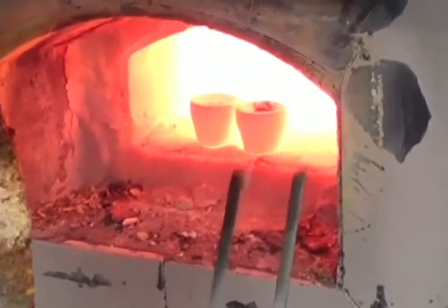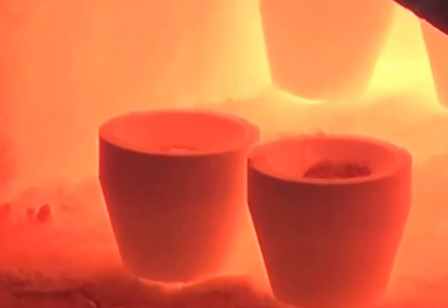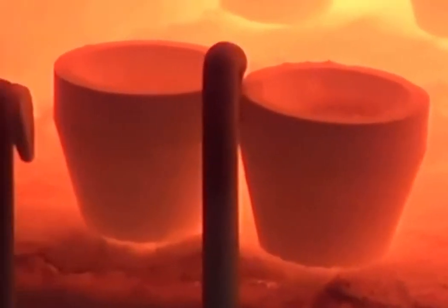This process begins with sample preparation. A representative sample is obtained from the ore, concentrate, or bullion. This sample must accurately reflect the composition of the entire batch. The sample is then finely ground to ensure homogeneity and to expose the precious metals for analysis.